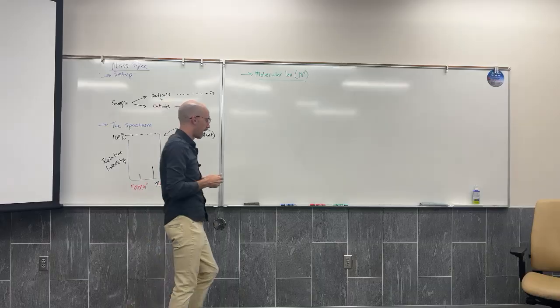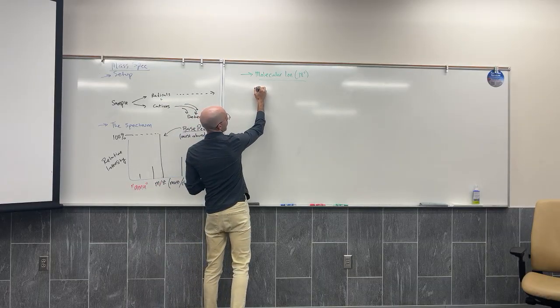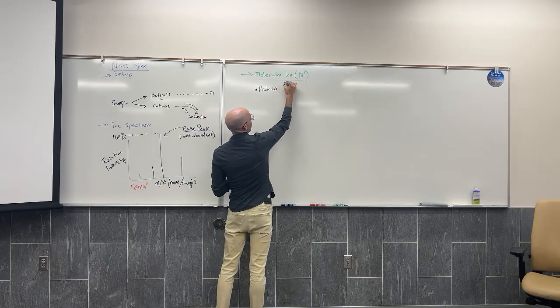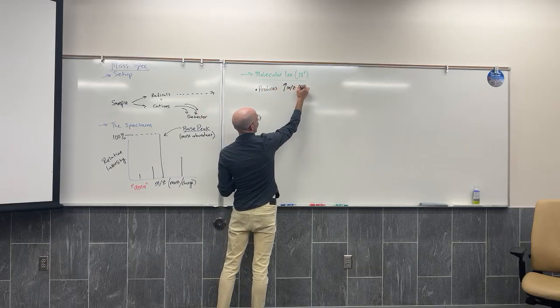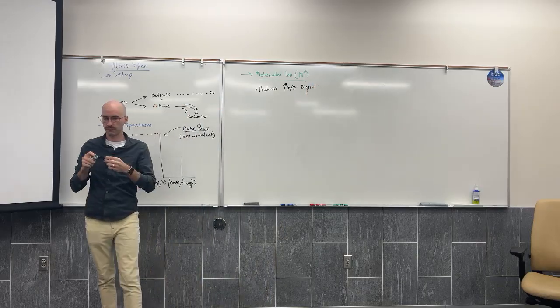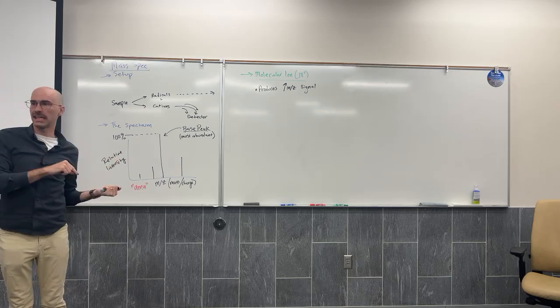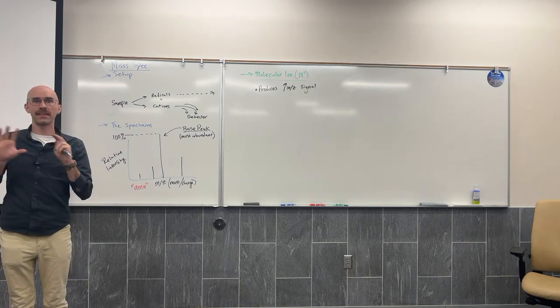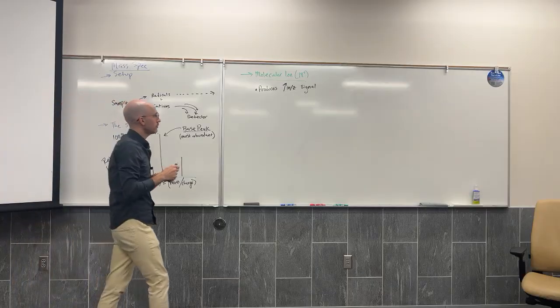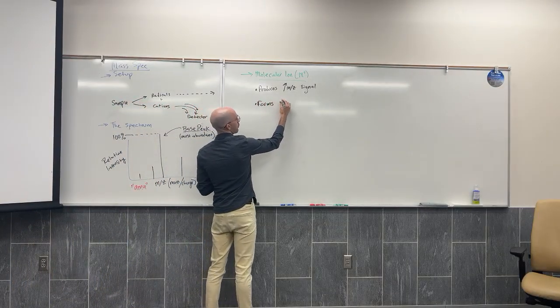The molecular ion can form by, well, first let me say, this produces the highest mass per charge signal on the spectrum. I can't get a heavier mass to hit the detector than the entire mass of the molecule. And it forms by one of 3 ways.